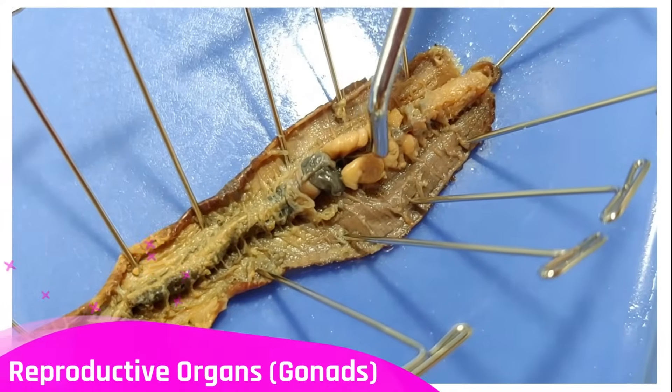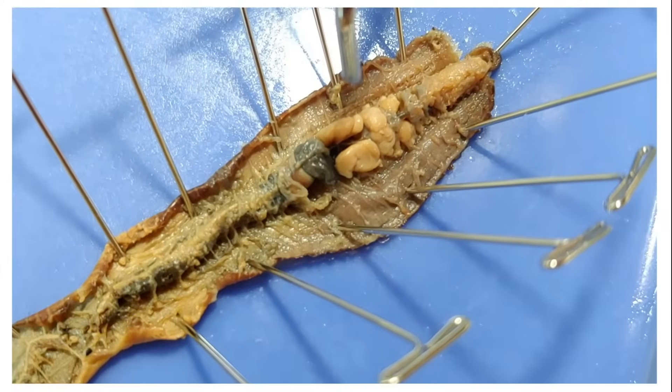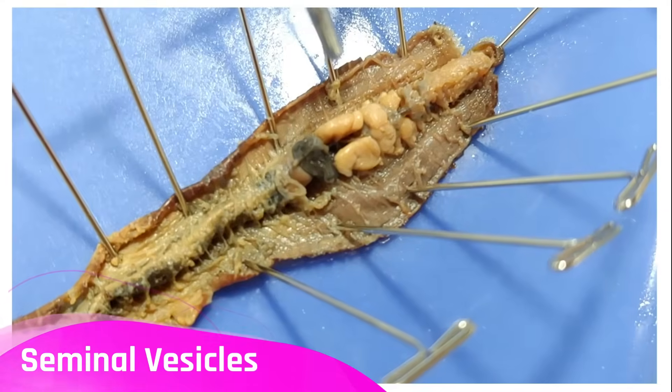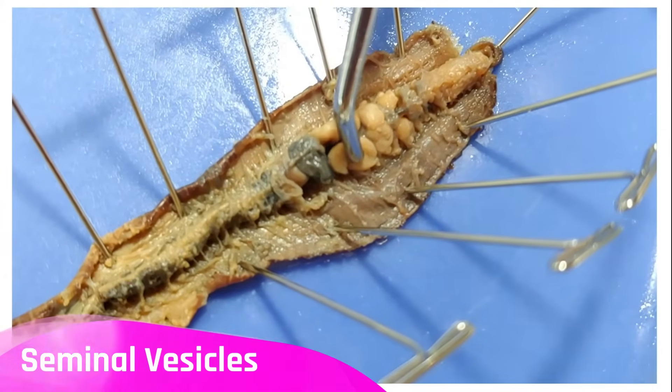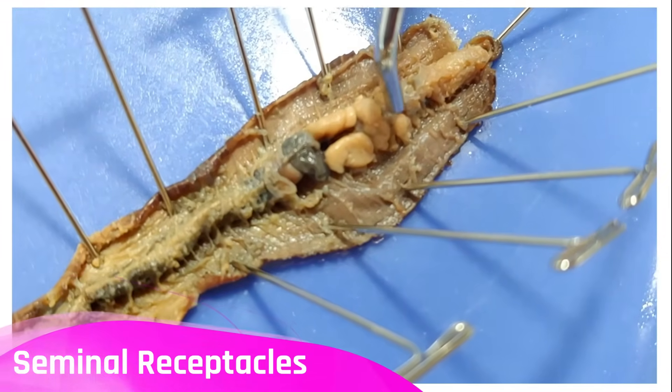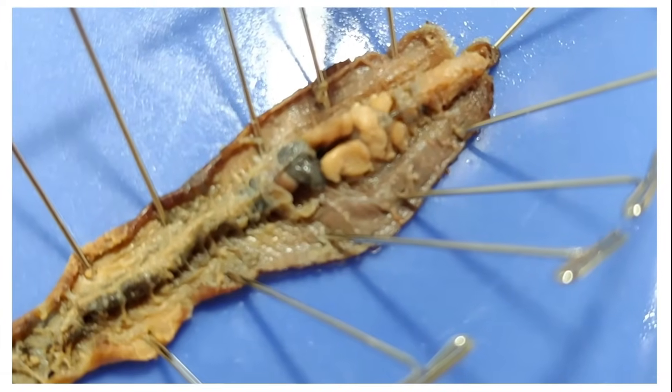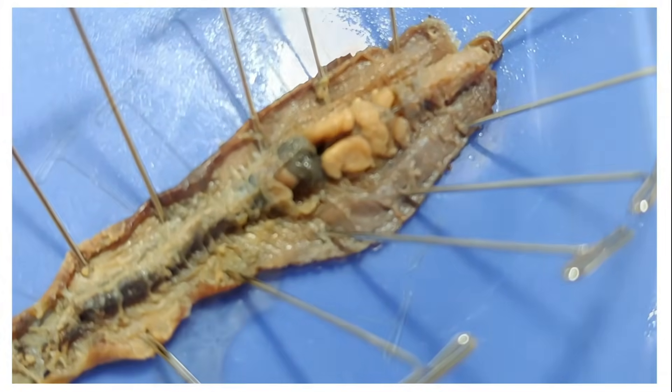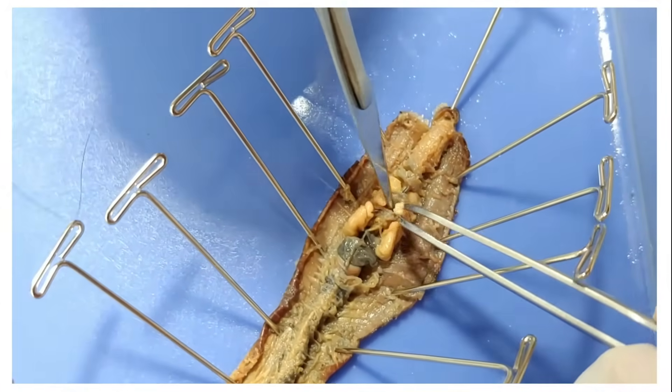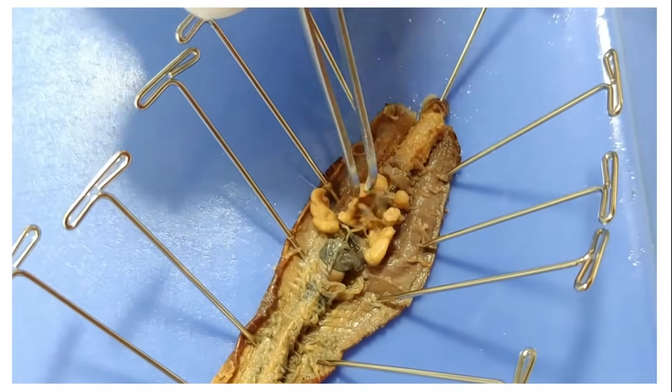Down here are the reproductive organs. Worms are hermaphrodites which means they have both male and female reproductive organs. The male organs are the seminal vesicles which produce sperm and are right here. Now what's really interesting is what their eggs look like. So look it up for yourself. If you need extra incentive, I'll tell you worm eggs look like tiny lemons. Right now I'm moving these reproductive organs aside.